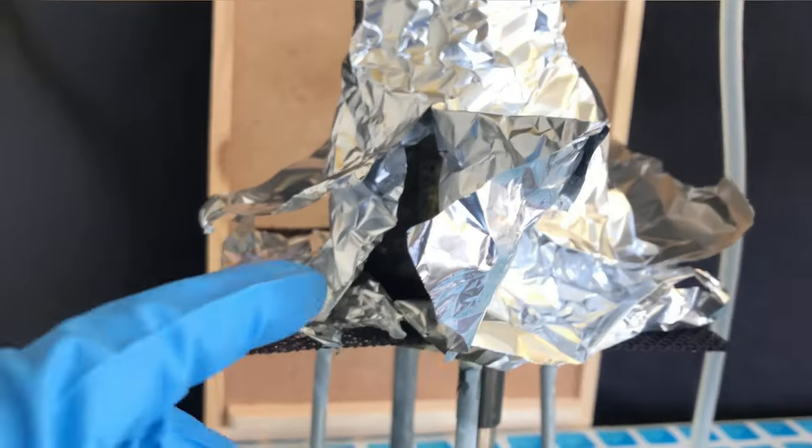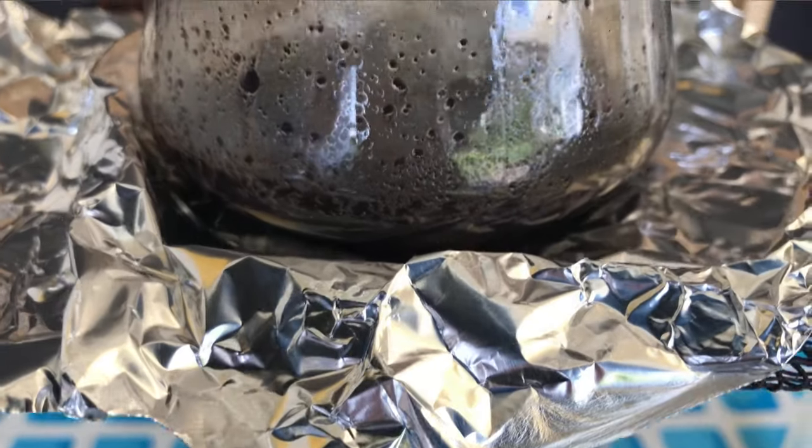If we continue heating, we might run the risk of creating a lot of white phosphorus, and we don't want that at the moment. You can now see a lot of beautiful black tar.